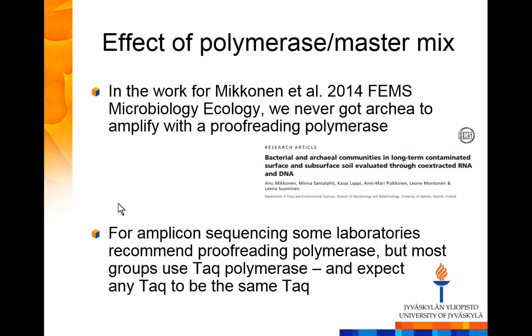So I think that's what people mostly do. A lot of, I think, sequencing laboratories recommend using proofreading polymerase. And there's definitely no harm if it works well on your samples, if you got your targets to amplify. But it will cost a lot more.